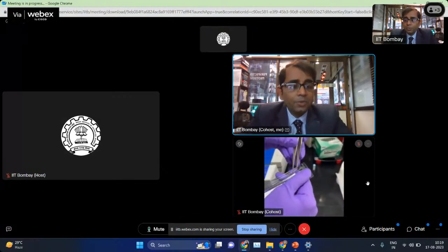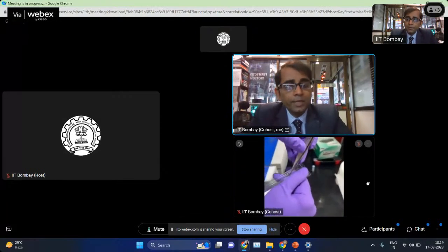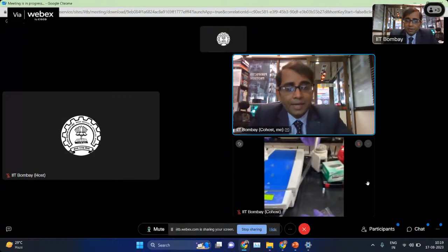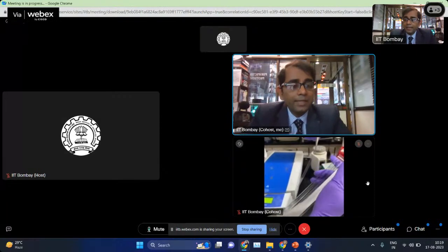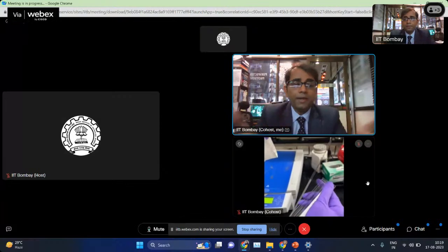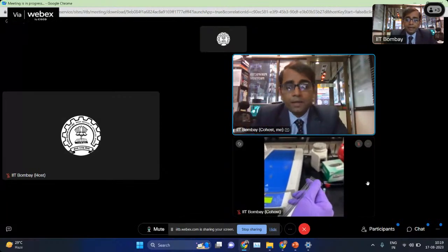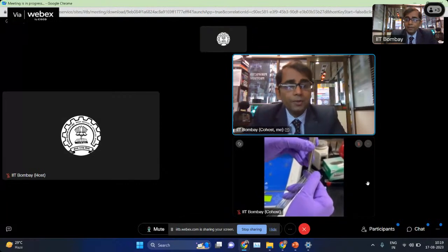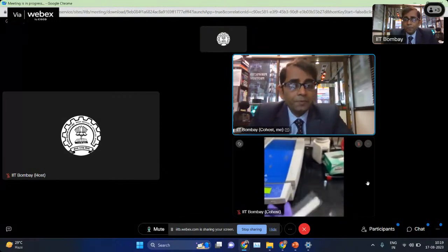Sometimes it is pH 3 to 10, sometimes it can be 4 to 7. Depending on your question, you'd like to choose the kind of strip which you see right on the frame. And then you take a rehydration tray, and in that tray you can put the protein, and then on top of that you can place the IPG strip.